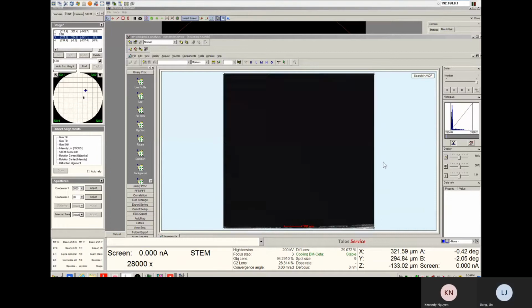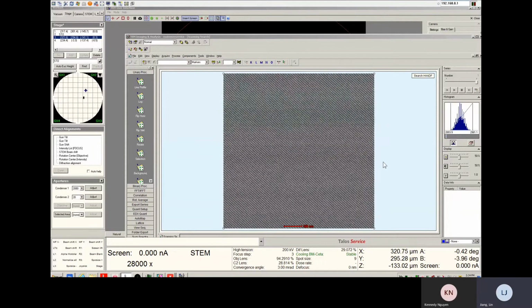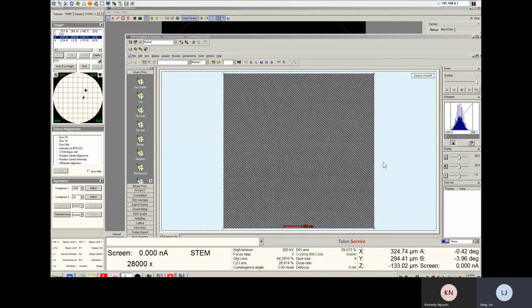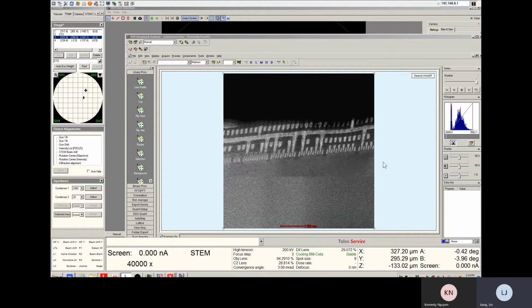Good. Okay. Let's say I want to do mapping on one of this.